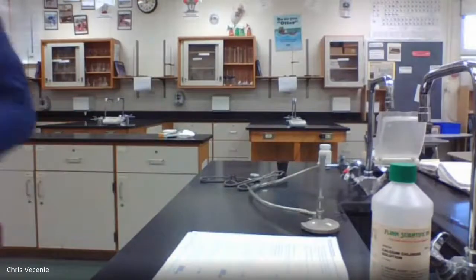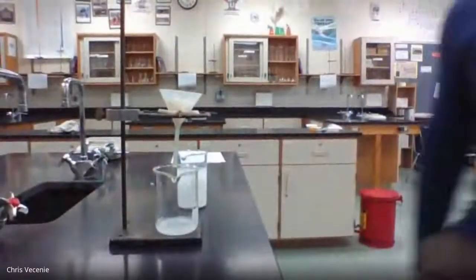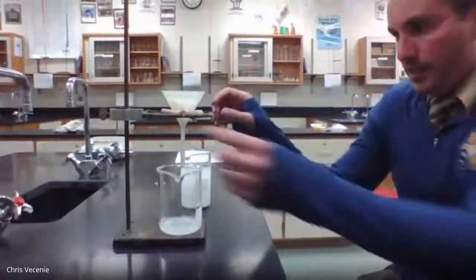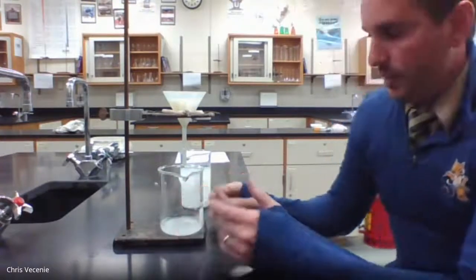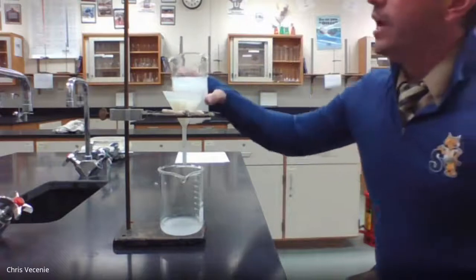All right, now I'm going to take you over here because we are ready to start filtering. So what you see here is a filtration setup. I've got my funnel sitting on top of a ring stand with an iron ring, and then I've got a beaker underneath to catch my filtrate. All right, so what I'm going to do is take my substance and pour it.